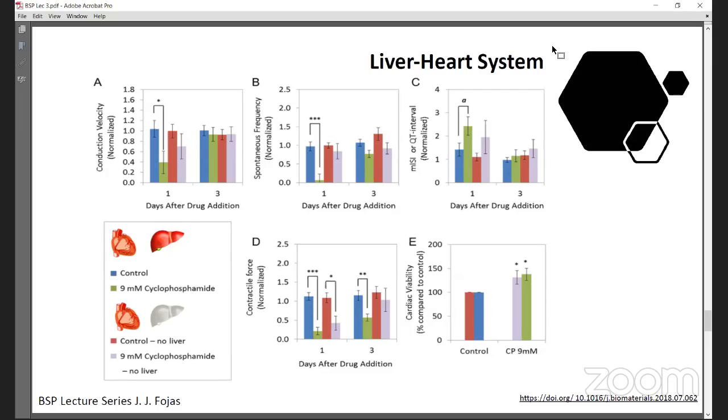Consequently, this transformation may cause changes in drug bioavailability and function and even degradation. In this sense, the effect of the liver may generate metabolites that are more toxic or more effective than the parent drug. This is essentially what they did. A system that enables the co-culture of human cardiomyocytes with hepatocytes would be a key development in the human on-a-chip system to enable the study of induced cardiotoxicity upon hepatic metabolism of compounds as well as hepatic toxicity. These types of BOCs enable non-invasive readouts of your cardiotoxicity of drugs and their metabolites.